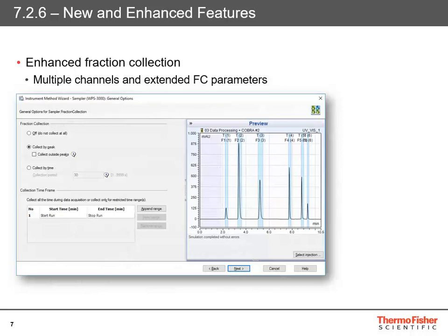The first new feature is enhanced fraction collection. We've extended fraction collection to cover multiple channels and more available parameters. This is the fraction collection wizard in Chameleon. On the right-hand side you see a preview — if there's an injection in the sequence already, as you go through the instrument method wizard, it will pick up that injection and preview what your fraction collection will look like. You can also use the button in the right-hand corner to select any chromatogram, and as you change the fraction collection settings, it will simulate exactly what the fraction collection is going to look like.